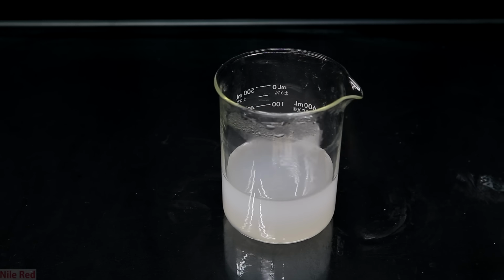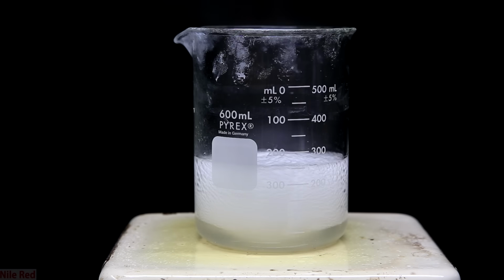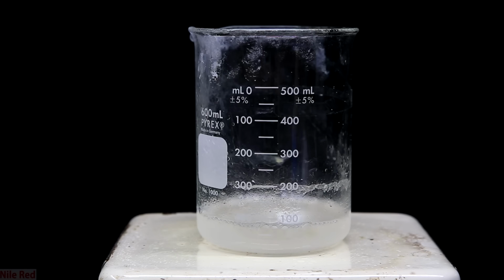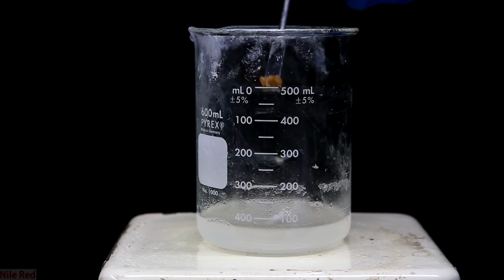The next thing we need to do is again concentrate the solution by boiling it down. So just like before, we put it on a hot plate, and with some strong stirring we boil it. The goal is to boil it down until it's pretty much around 50 milliliters. You might notice that there's a little bit of yellow polymer floating around. This is remedied pretty easily, and I just take it out using a spatula.